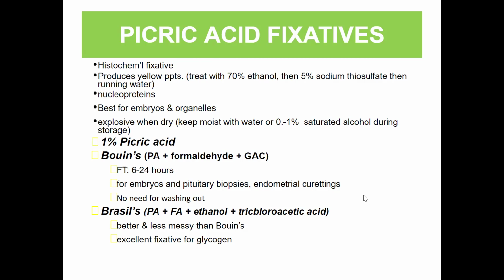Another is Bouin's, which is picric acid plus formaldehyde plus glacial acetic acid, with a fixation time of 6 to 24 hours. Used for embryos, biopsies, pituitary biopsies, and endometrial curettings. So, you don't need to wash out the dye for your Bouin's.